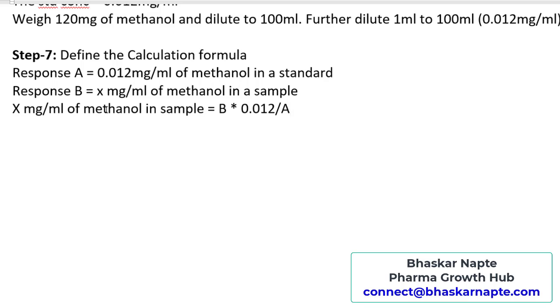The next, this is a very important step. Can I say 1 ml of sample will present B into 0.012 divided by A milligram of methanol?